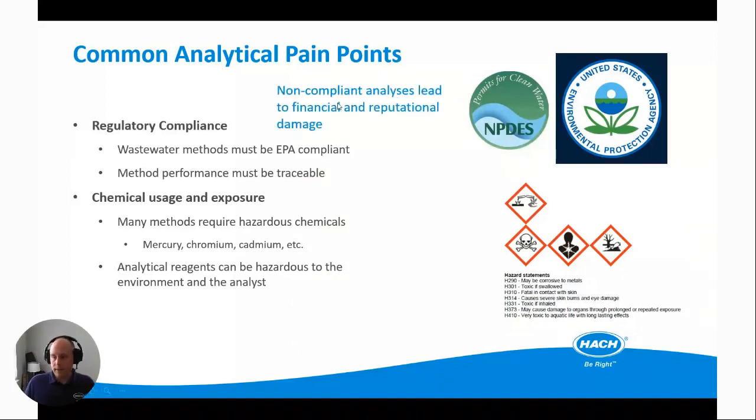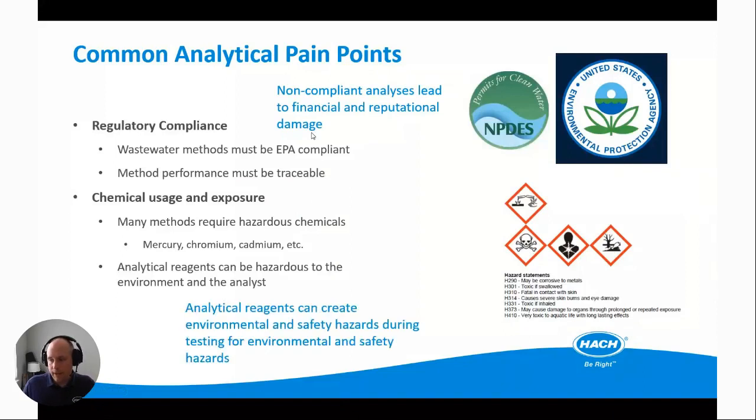So, end result, non-compliant analyses lead to financial and reputational damage. And analytical reagents can create an environmental and safety hazard while you're in the process of trying to test for an environmental and safety hazard. So a lot of things to think about, a lot of different issues that can go into what seems like a pretty simple measurement.